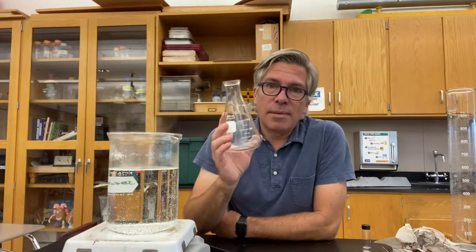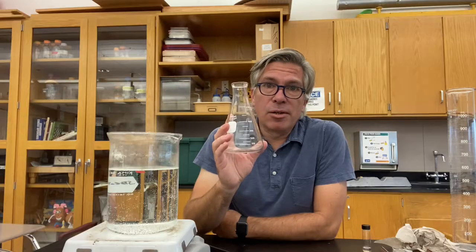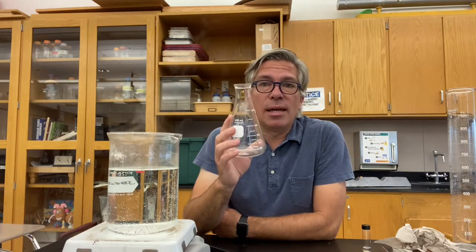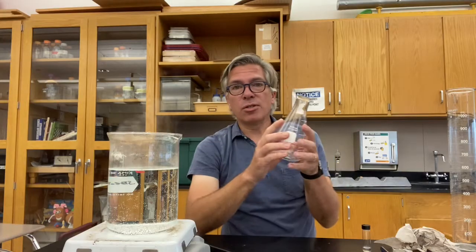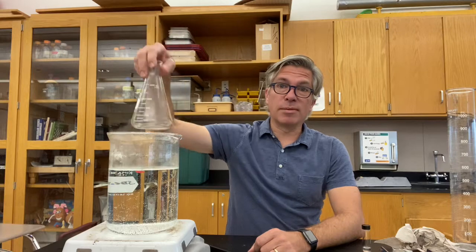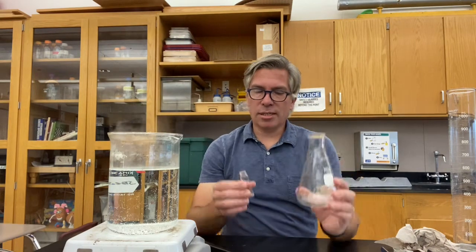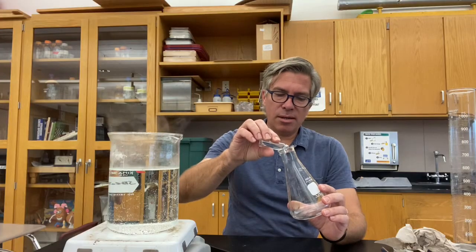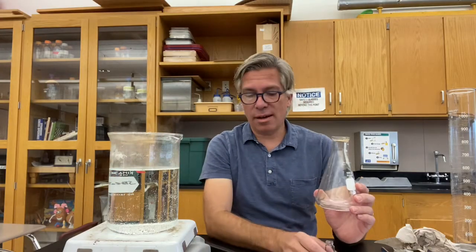First, I want to get myself a flask, and the bigger the better, because the bigger the sample you have, the easier it is to measure it and the less error we're going to have. I'm also going to get a boiling water bath going, big enough that the entire flask will be able to fit inside. Next, I'm going to take a small amount of my liquid and pour it in. The exact amount doesn't matter, and at this point I don't even have to find the mass of it.